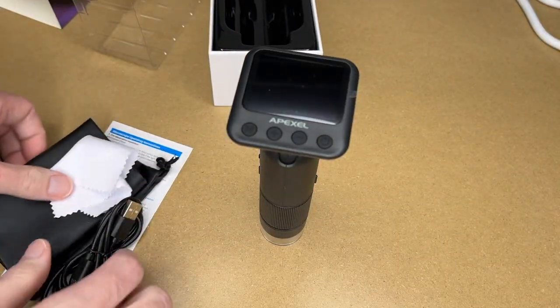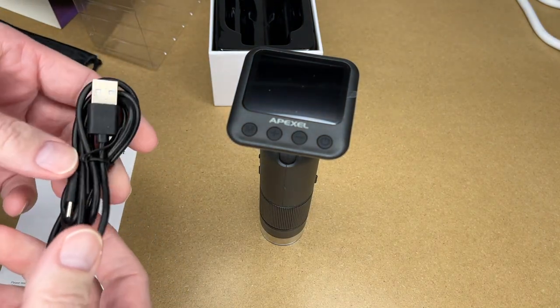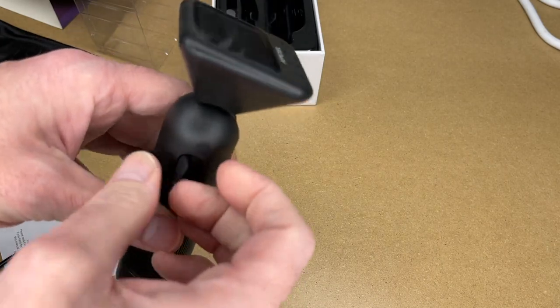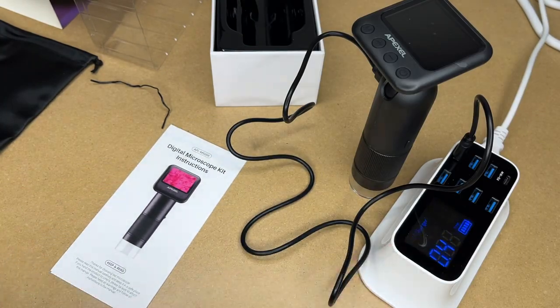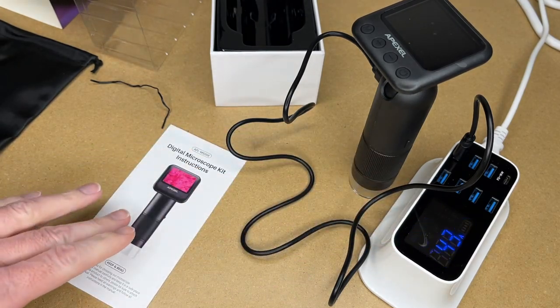Here we have the microscope. It comes with a cleaning cloth, storage bag, a manual, and a USB Type-C charging cable. The cable's around 40 inches. To charge this we'll open the port on the side — we can see the charge cable here. I'll plug into it and plug into the charger. We're currently charging at about 0.43 amps, which can vary depending on the state of the charge.